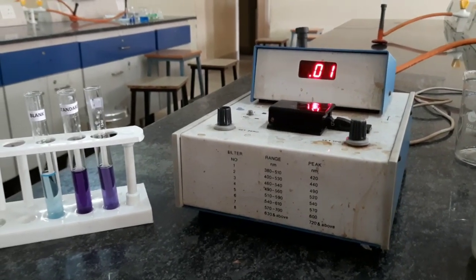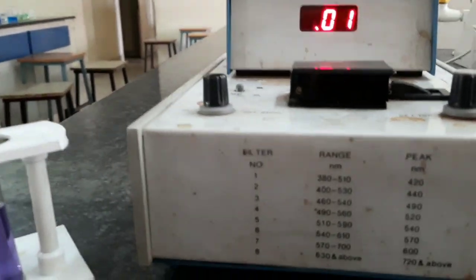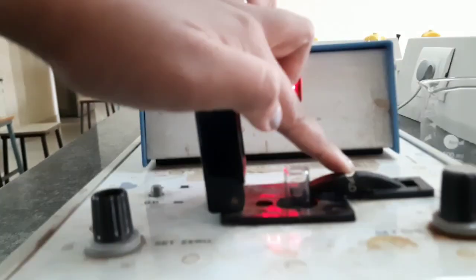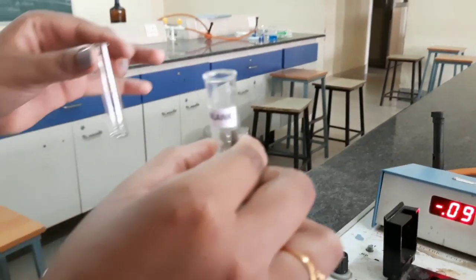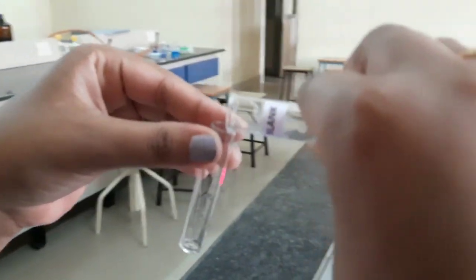Now we are going to estimate the protein using a colorimeter. Since we have to use 540 nanometer, we are going to use filter number 5. So you can see we have set the filter to 5. Now let us calibrate the colorimeter using our blank. We have to take the blank in a cuvette.